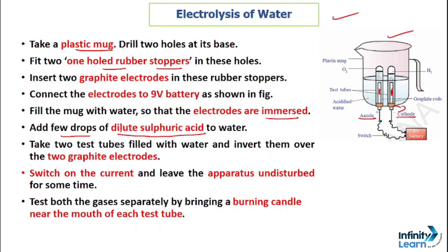Add a few drops of dilute sulfuric acid to the water. Cover the electrodes with two test tubes — both will fill with water. Switch on the current and leave the apparatus undisturbed for some time. The electrodes will start generating bubbles in both test tubes. Once the test tubes are filled with gas, take them out carefully. The test tube connected to the negative terminal collects hydrogen, and the positive side collects oxygen.